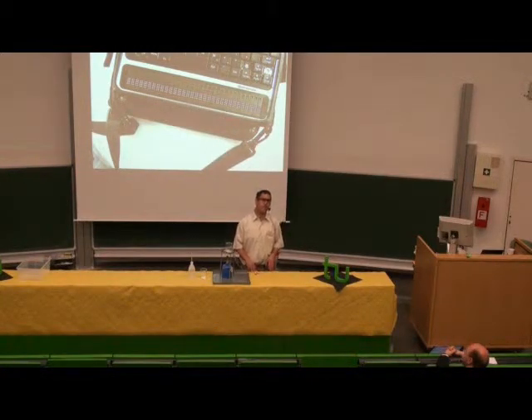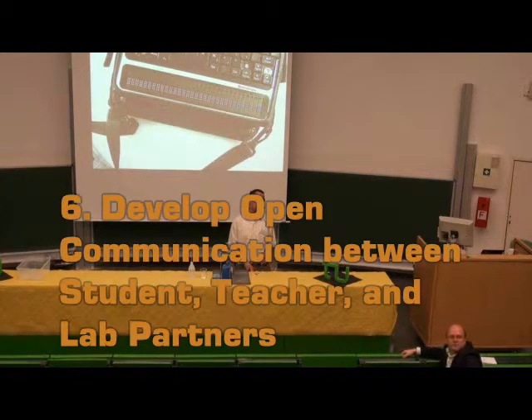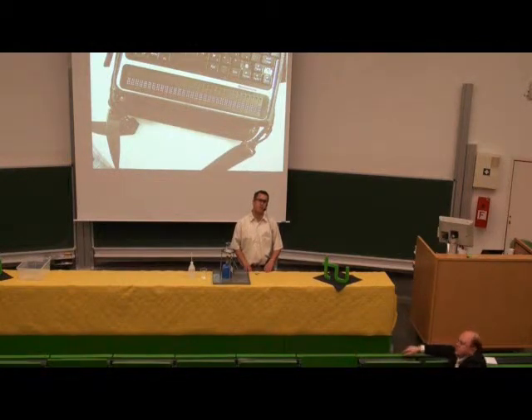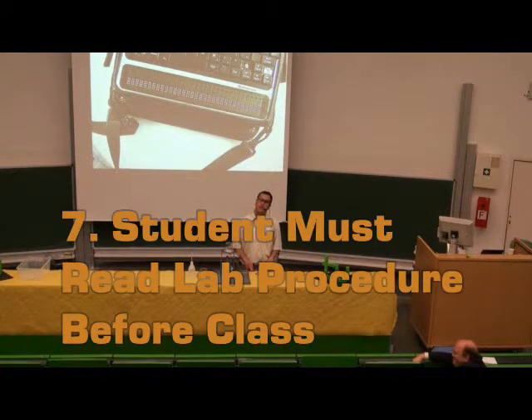They also need to have ways to communicate with their lab partners as to what their needs are. Good communication — being quiet and shy is not a good thing in a science class. They have to be outspoken. The critical thing that I instruct every student is that they must read the lab procedure in advance of coming to lab. Because if you understand the lab procedure, you know what equipment you're going to be using, and you know theoretically what should happen and what you should be observing. So if you have a blind student on a team and they know what should be happening, they can ask questions.